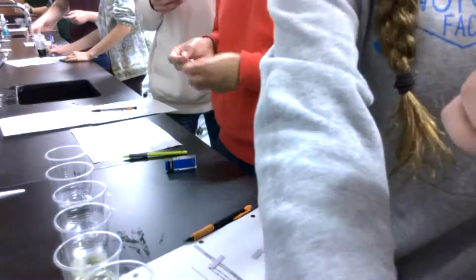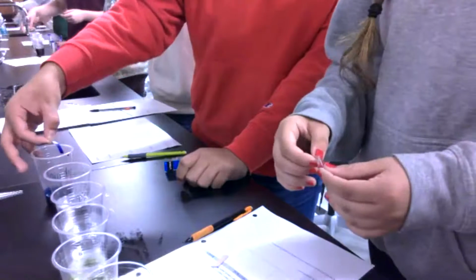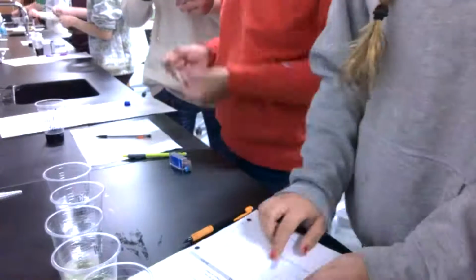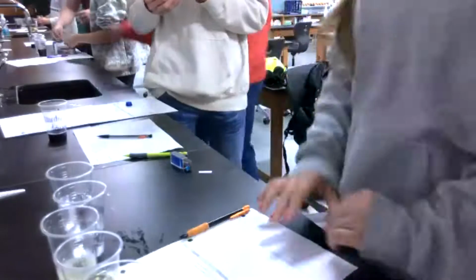Bases turn red paper to blue. This is the only base. All these are acids. I think that's just a laundry detergent stain. That's right. Okay, yeah, where's pH? Well, look, this one turned like blue. That was pretty. That's like my favorite color, purple. Okay. Where's the detergent?